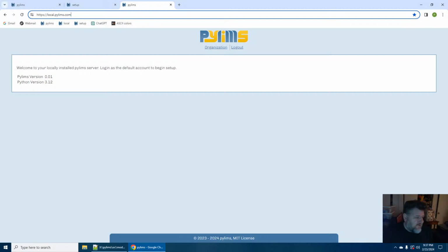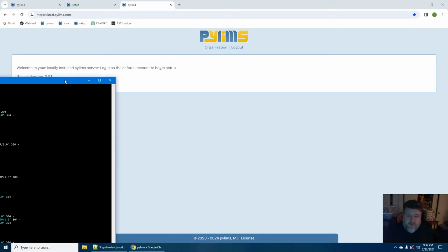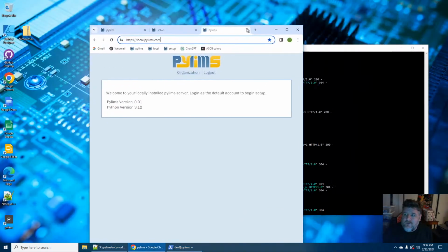I can go a little bit more into that later, but basically I'll drag over my console window here. Whoop. So every time, actually, I don't know how to make this stick up top, so let's make this a little smaller.